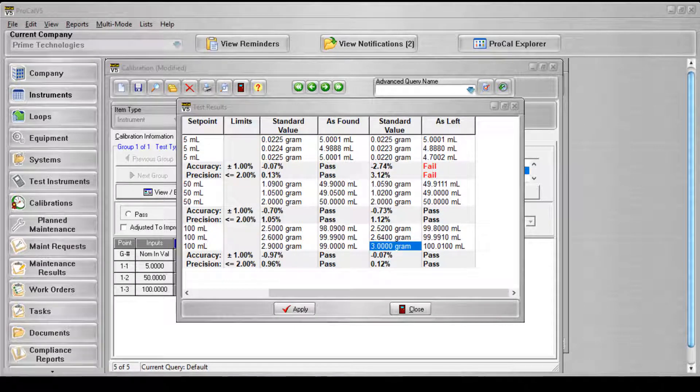The pass-fail criteria for the test results screen is as follows. An as found failure equals any set point's as found accuracy percent or precision percent greater than the specified limit for the current set point. The specified limit refers to the accuracy percent grid column for accuracies and the precision percent grid column for precisions for a given set point.